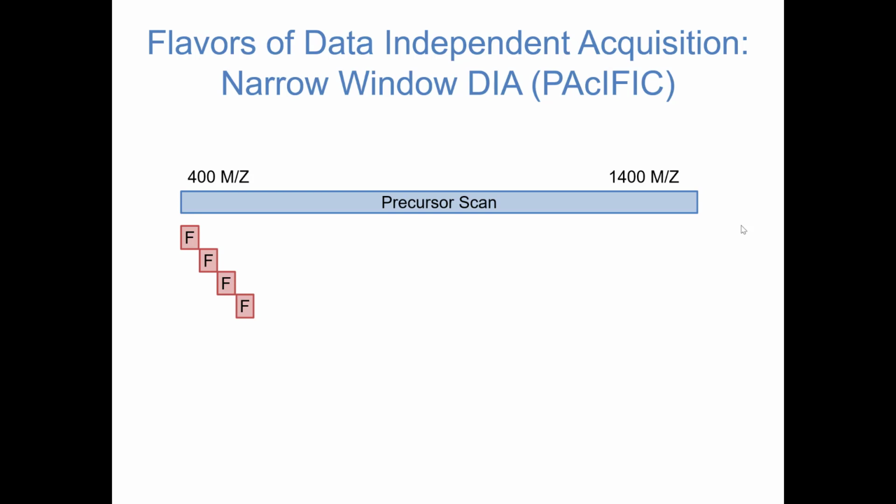And we've done experiments since that show that if you're just using straight MSE, you should not use fragment ions to quantify. You need the extra isolation to make it advantageous. Yeah, it really wasn't until HDMSE where that became much more viable. Yeah, this is definitely a good point.